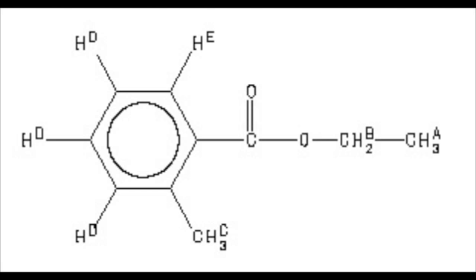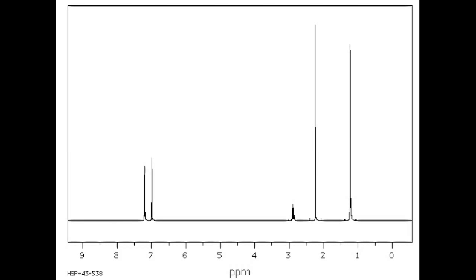And now we're going to move on to another spectrum. And hopefully our skills will be a little bit honed now that we've considered that stuff. Alright, so looking at this spectrum, we see a couple signals way down there at 7 again. So I guess we're expecting another sort of aromatic ring. And the rest of the signals, it's kind of hard to tell just how many peaks the one at 2.9 or 2.8 is. And believe it or not, that's actually why I chose this molecule.